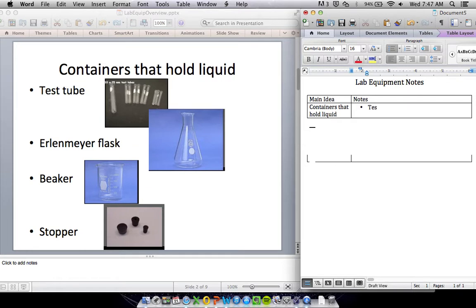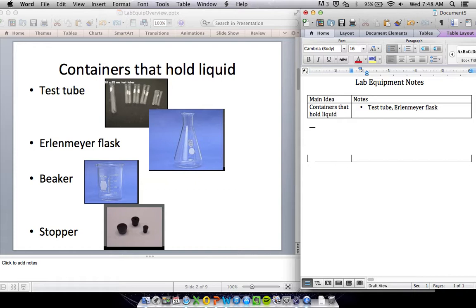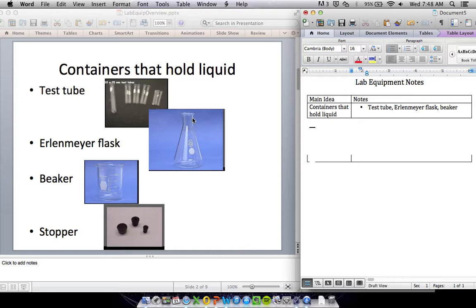We've got a test tube, used for small amounts of liquid, and an Erlenmeyer flask. You do have to know how to say that and spell it: Erlenmeyer flask. It's spelled exactly the way it sounds, and it's always spelled with a capital E because it's named after someone. We've got a beaker. Notice the difference between these: the Erlenmeyer flask is narrow at the top.